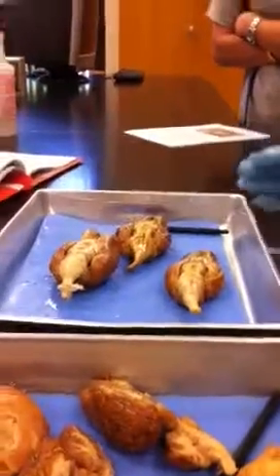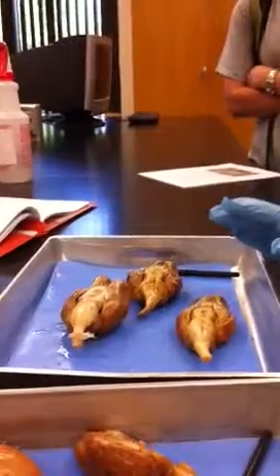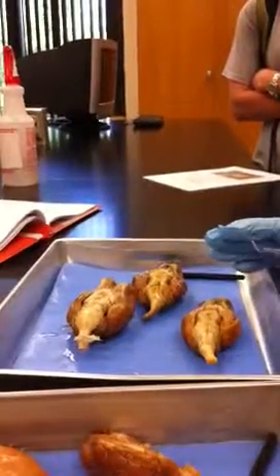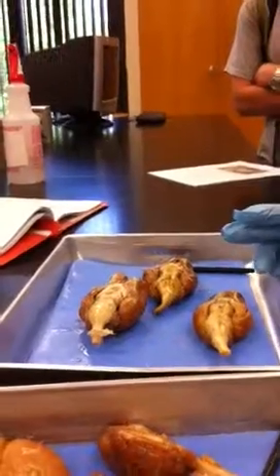Pieces, it's got kind of a groove in the middle of it, but it's all one piece. And so, just like most things, it is symmetrical. Right. So on one side, you have a mirror image of the other side. Okay. So what's next?